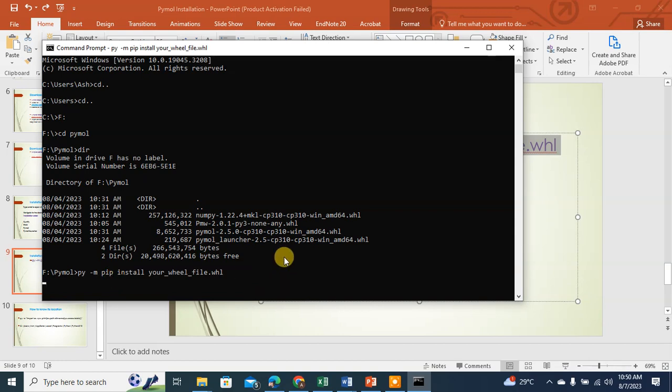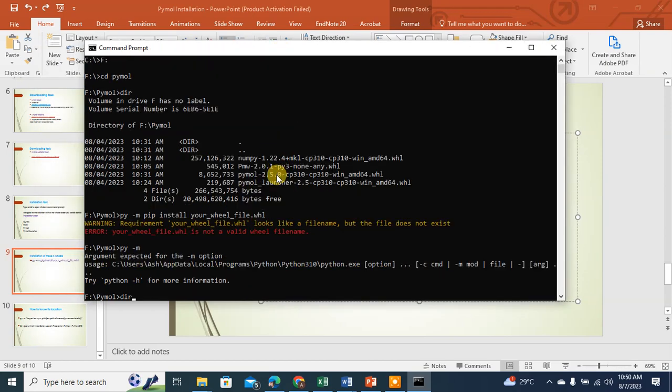It's like this. So now wait, okay, I think we need to type it py -m pip install.